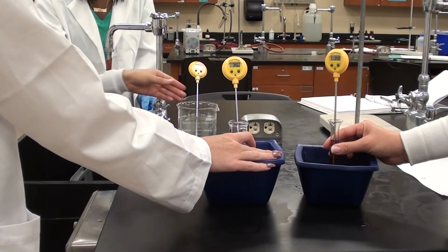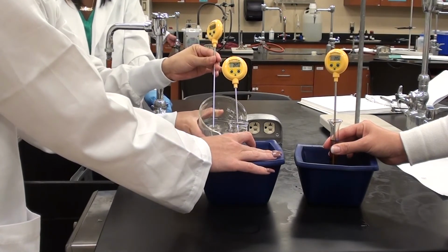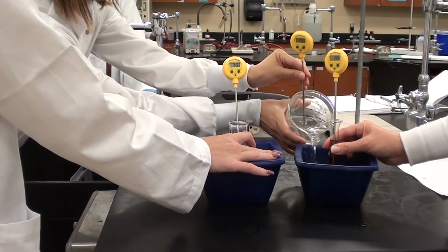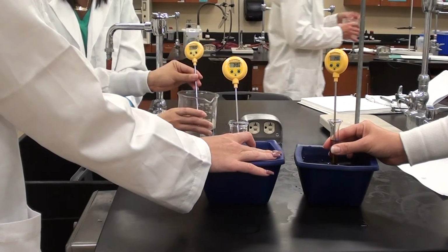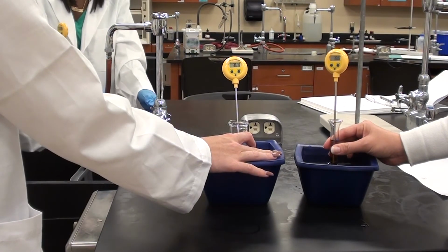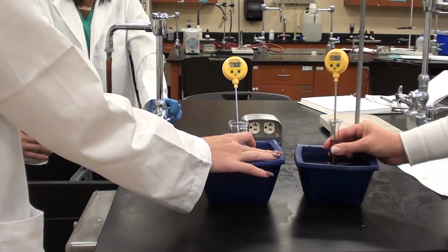Now I'm going to ask you to add more water to each of these here. Okay, that'll do. And that'll do. Alright, good. Alright, now I'd like you to pour that hot water out, and we'll get some more hot water in a second. Not right now. So okay, turn it off, Tiffany. So, thanks.